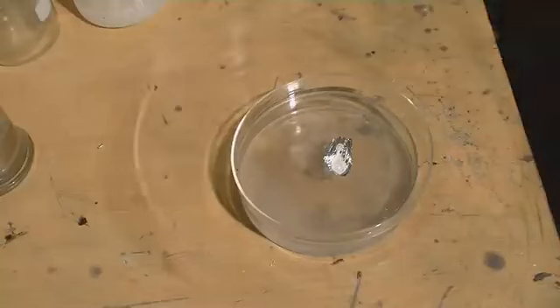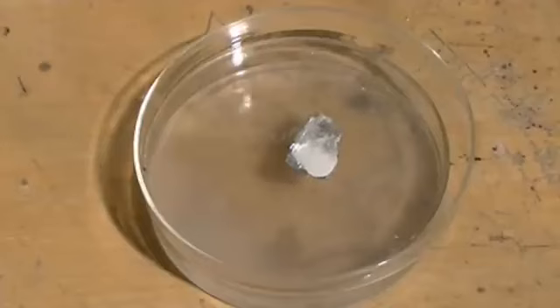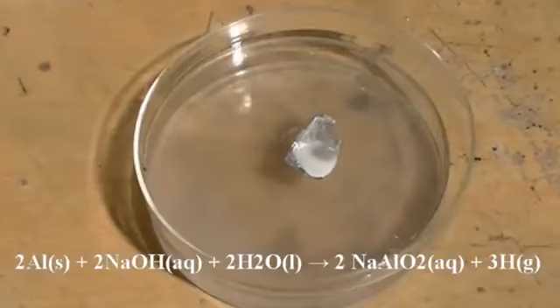To start with, we're going to pipette a small amount of our concentrated sodium hydroxide onto some aluminium foil, and you can see a reaction where the sodium hydroxide is reacting with the aluminium to form sodium aluminate and hydrogen gas.